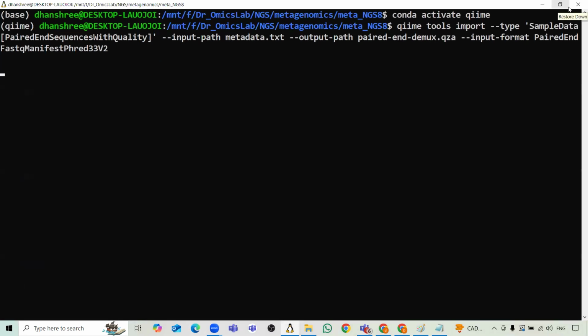This command will take some time, sometimes more than 10 minutes. So you just have to wait till it is completed.